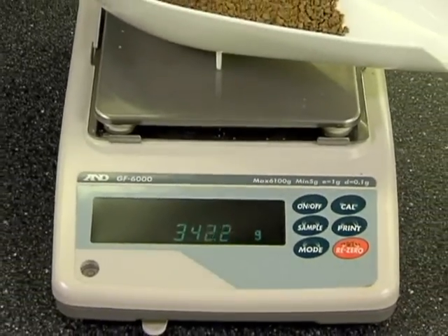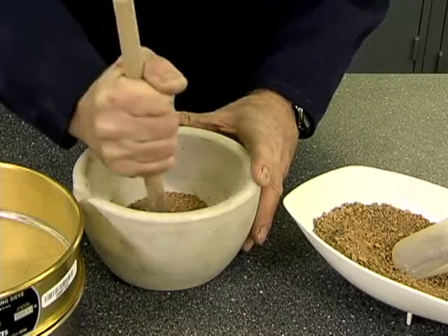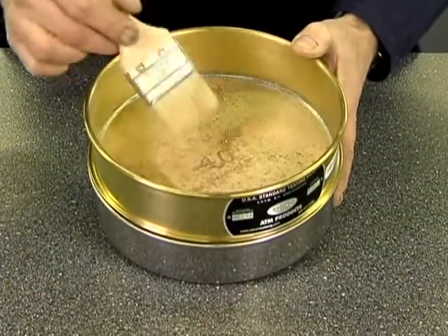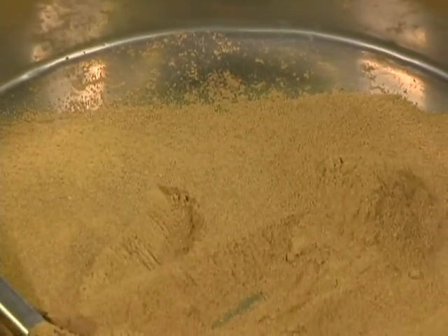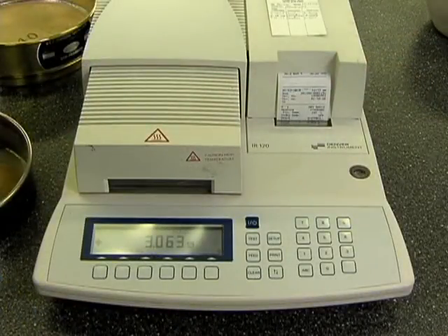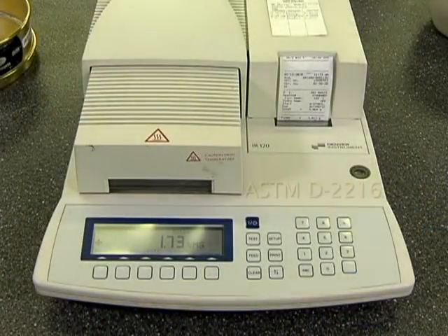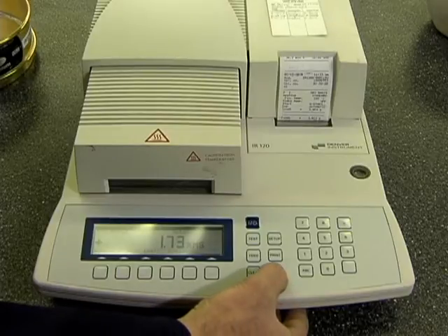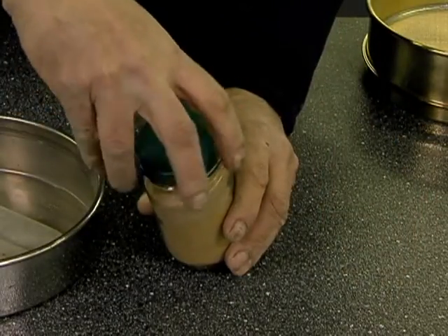The specimen preparation involves several basic steps, including using a balance to measure a minimum of 350 grams of soil, gently pulverizing the dried soil with a rubber-tipped pestle, screening the soil through a number 40 sieve, and then thoroughly remixing the soil that has passed through the screen. Weigh the sample again and oven dry if necessary to obtain a constant weight, and determine the water content of the sieved material following ASTM D-2216. Keep the sample in an airtight container to preserve water content until ready to run the procedure.